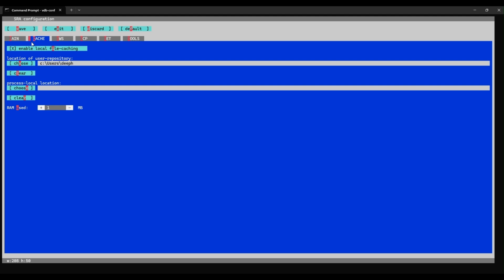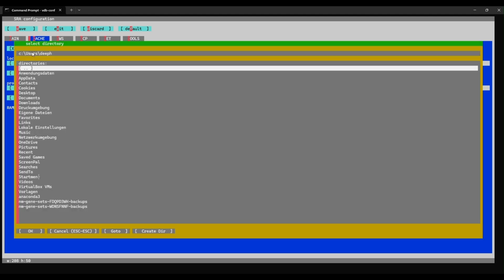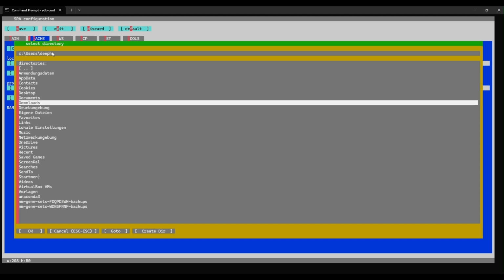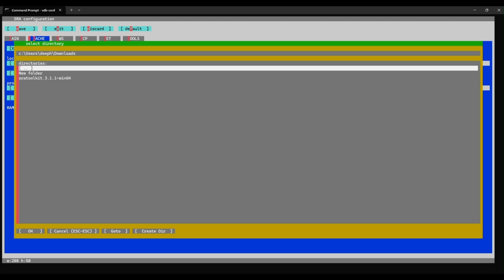So here I can press O and go to this part. Here I can change the download location. Now my download location is here. And if I want to download all the files in one folder, I can change the directory here. So I want to download the files in, for example, the Download folder, and now I want to create a new folder.